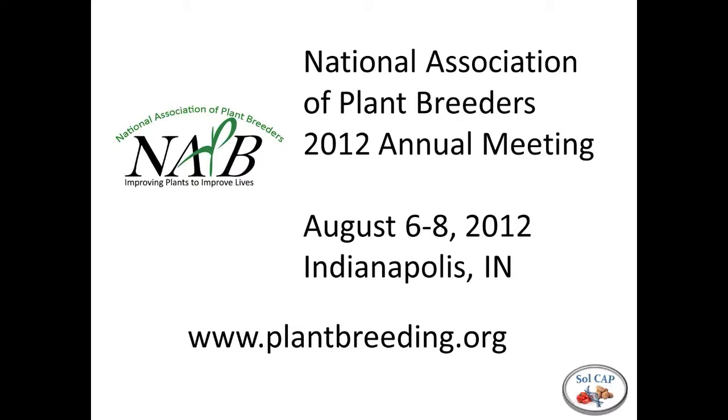I showed two slides with the genetic data, with the lines across the top and the markers as rows, where you're just defining the file name, the type of population, number of individuals, and number of markers, with a header at the top. So it sounds like a pretty standard file format. Exactly. You can basically use the same file for JoinMap, with the exact same file.